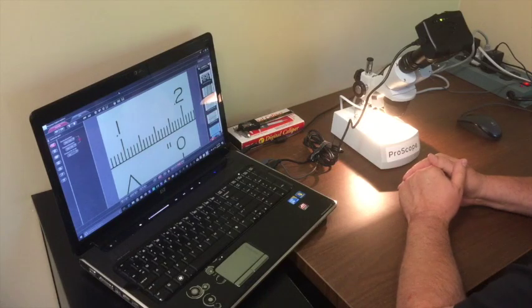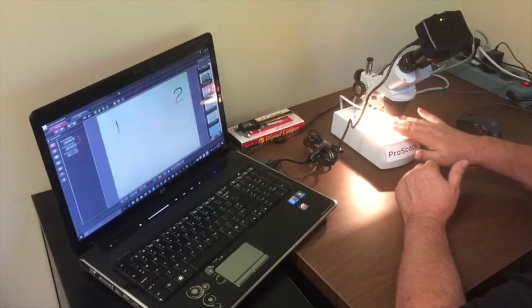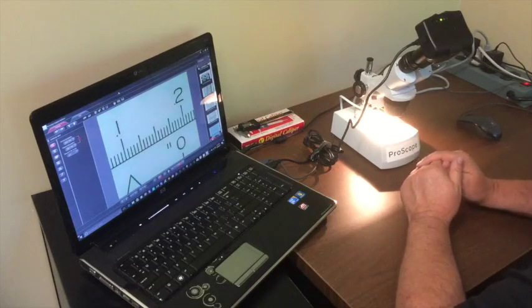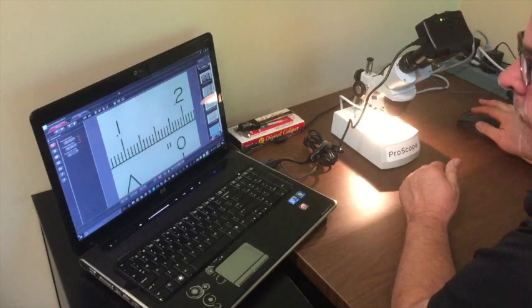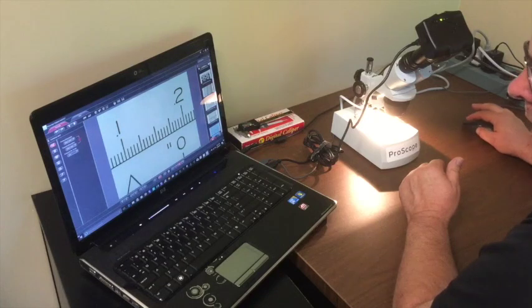Right now we're viewing a live image from the microscope camera, and you can see it on screen here. You'll notice the hash marks — the distance between point one and point two is in thousandths of an inch. This is a hundred thousandths as far as the distance from this hash mark to this hash mark here.